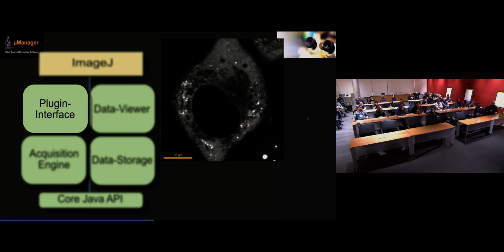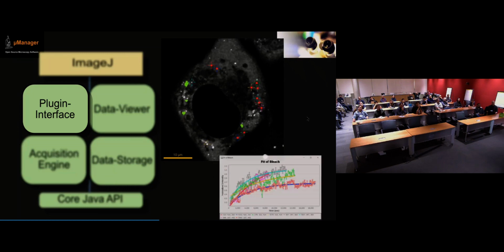There's a projector plugin that calibrates the Galvo to the camera, and you can then fire your laser at specific intervals. That is coupled with code that takes that data, analyzes it, sees where those bleach spots were, and then comes up very rapidly with bleach curves and kinetic data about these particles.